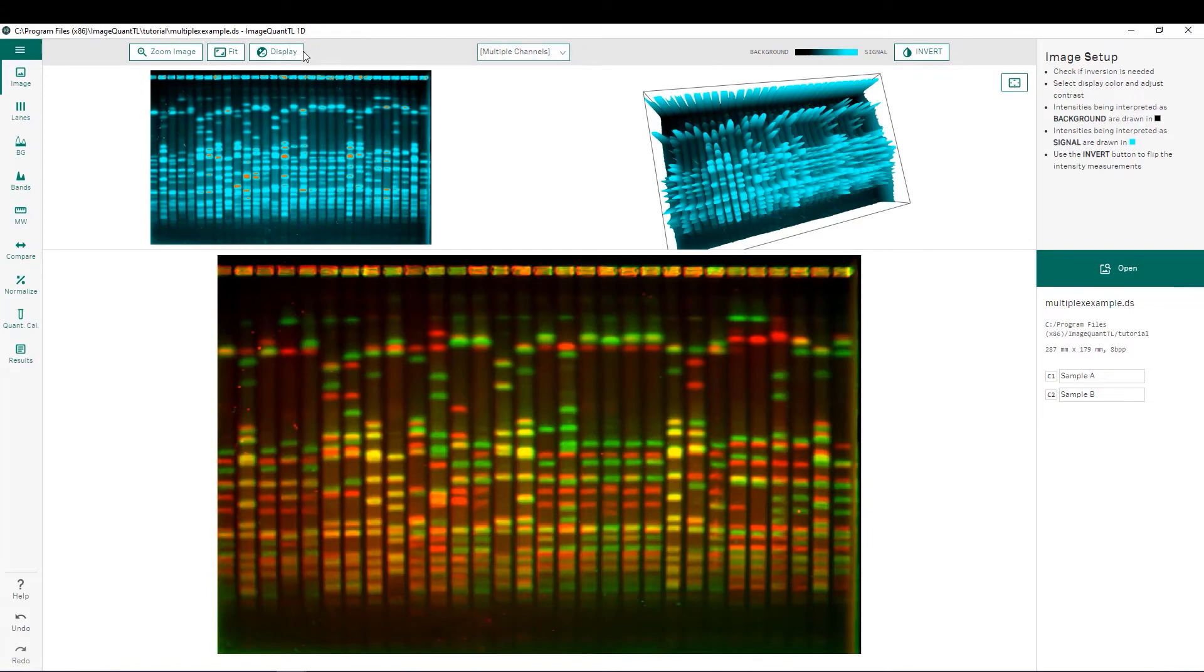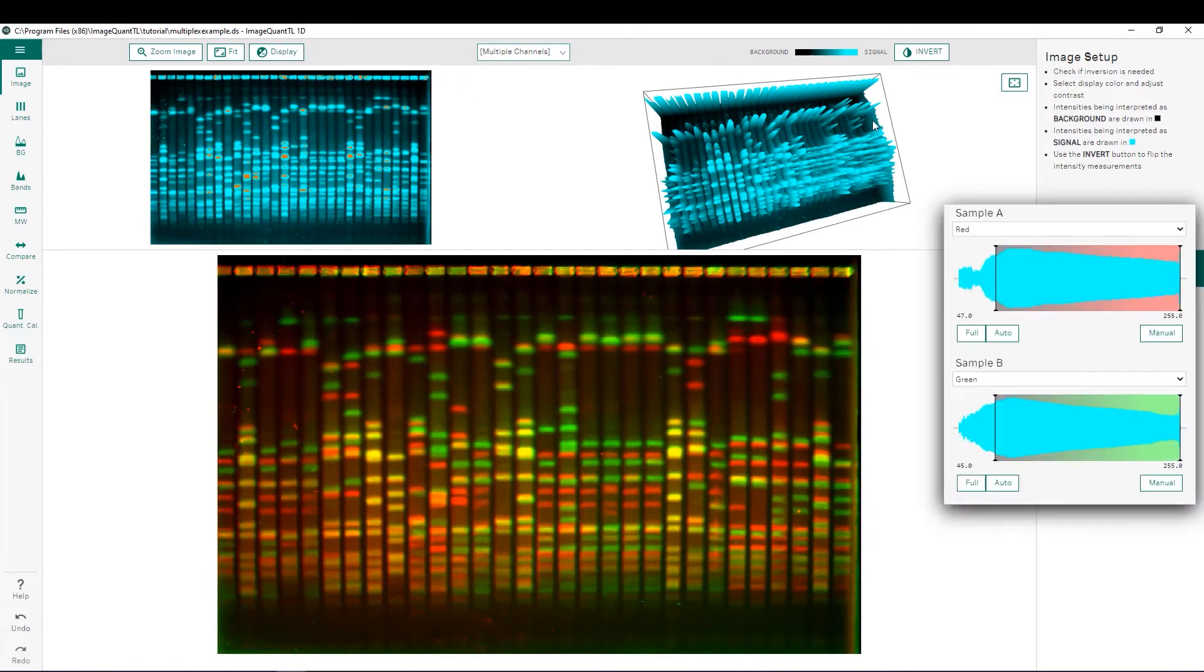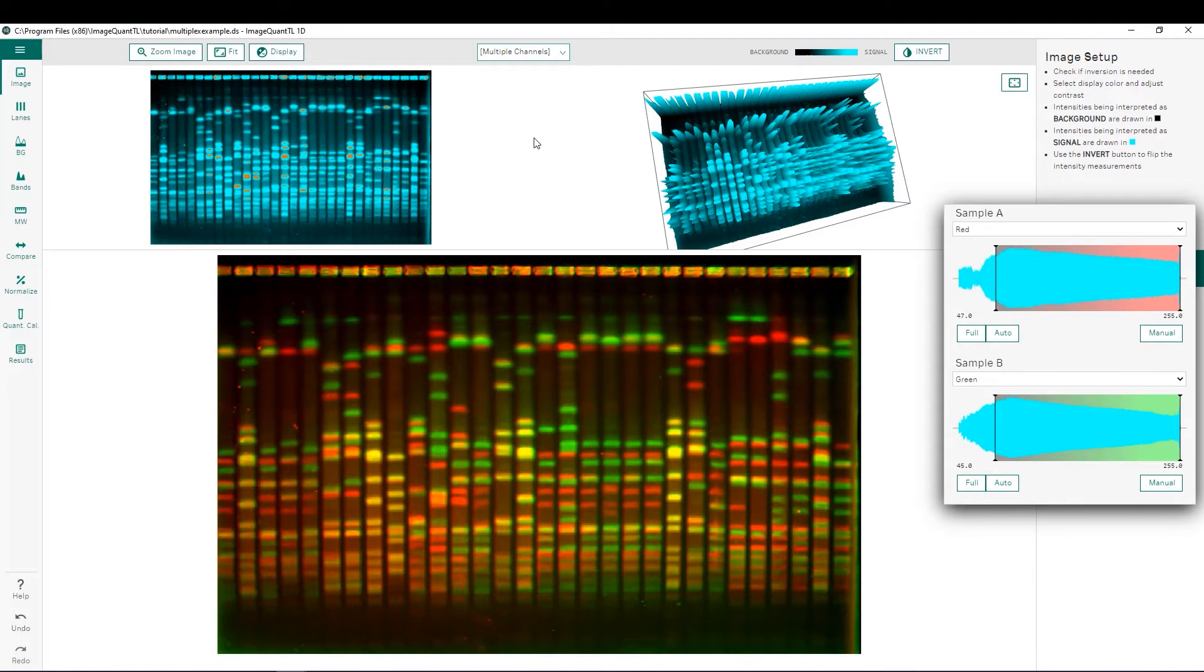We also have the ability to adjust our display so you can add any color overlays we would like for each individual channel as well as independently adjust our brightness and contrast for each channel.